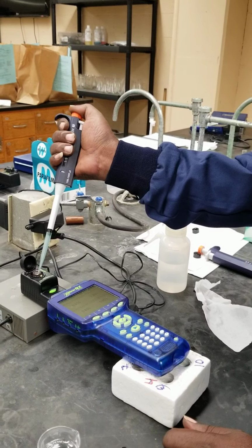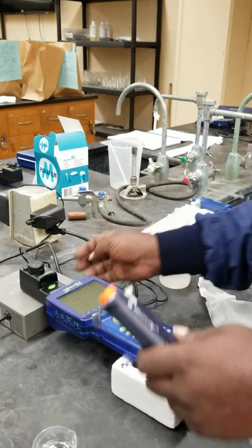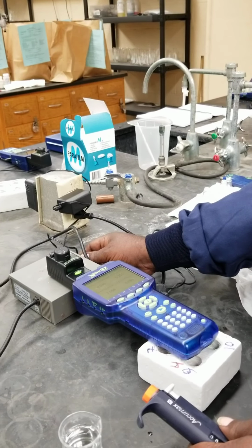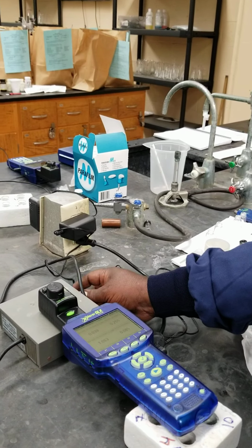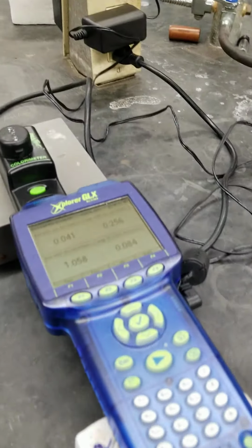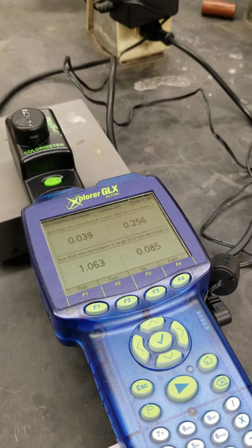That's the 8th addition. For the 8th addition, the absorbance value is 1.063.